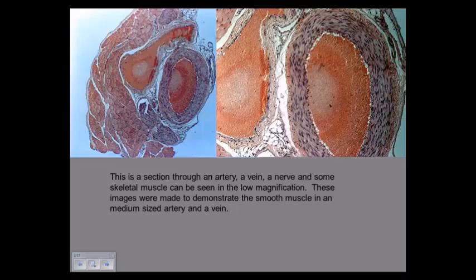And then you embed it with paraffin. It's like beeswax, okay? Some of it even has more consistency than beeswax. And then you embed it in that, okay? And that's why you take the water out, because then you can embed it. You embed it, and then you take really thin slices. And all those steps, you're actually putting tears in the tissue, and we call it artifact. Okay?